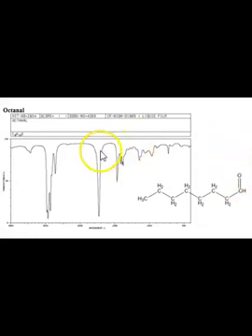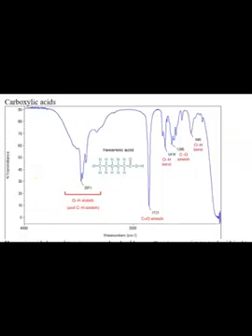So once you see this, at least you know you have 4 or 5 different possibilities. But the absence of this also tells you that you can rule out any of those things that we just talked about. And again, here's your characteristic CH bonds. This is just a more specific version, but a little bit different range. For example, if this is 2000 here, and this is 4000, then this is 3000, 2500. And so you just get a different shape because whoever produced this, whatever manufacturer, just had a different scale here. But the general idea is true.